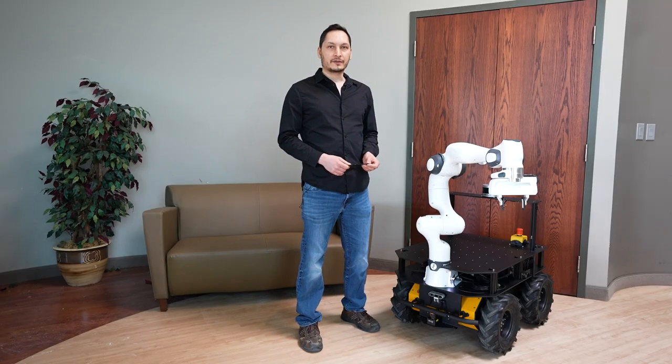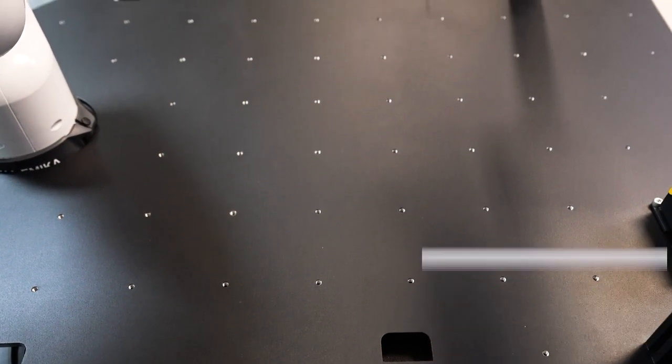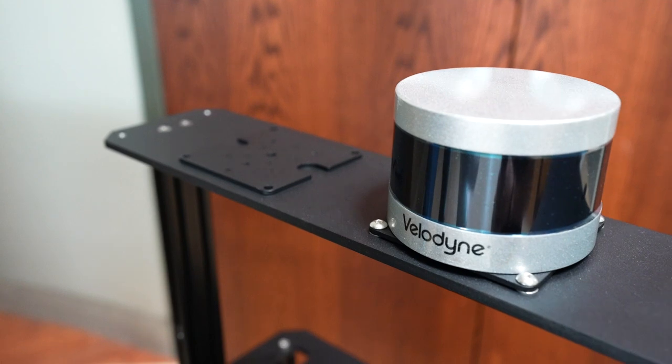An interesting feature about this robot is that it's fully PAX compatible. PAX is a ClearPath Robotics modular system to standardize adding components to a robot. It allows sensors and attachments to be integrated in real time, without messy drilling or machining parts.